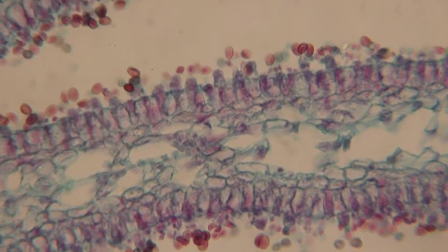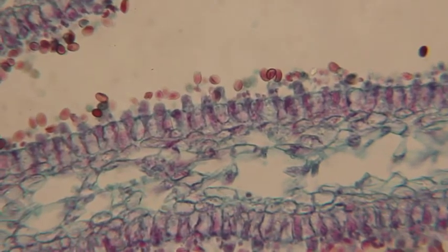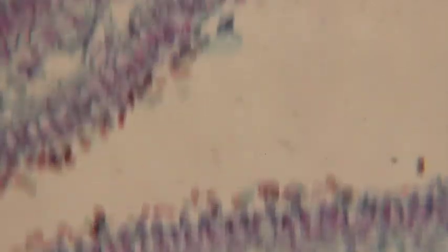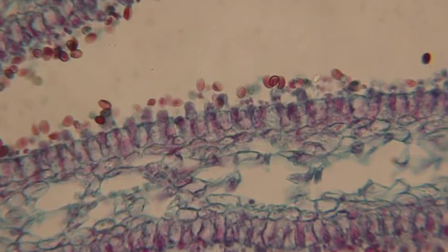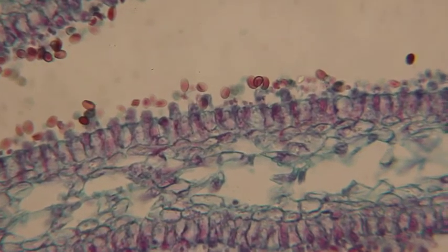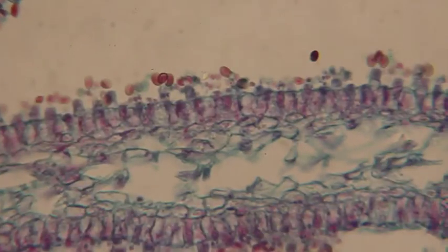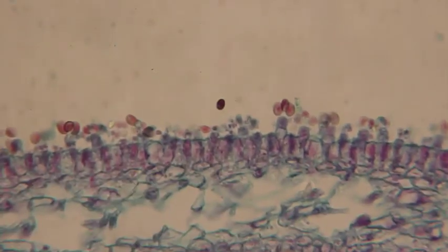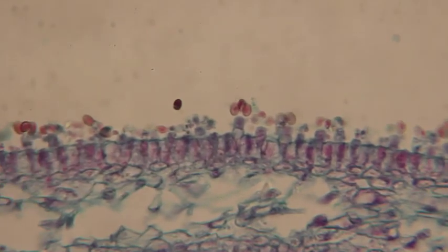Right there — you can see three of the four on this one. Now I'm going to center it. We can see that one right in the center, and we can see three of those spores. Oh, there's a better one — let's get that one. Right there in the center, and I'm going to slowly bring it even farther into the center.